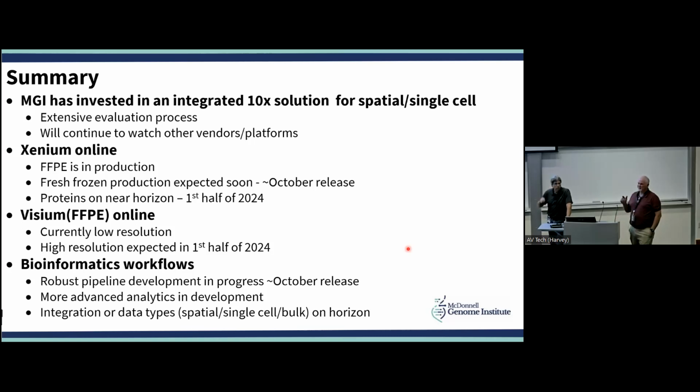One thing that didn't occur to me to begin with was if you design a panel, for instance, you want to think about that through all the perturbations you plan to do as well. And 10X walked us through a lot of that process, because it changes the gene expression significantly. So that's something you can work with them to keep in mind.